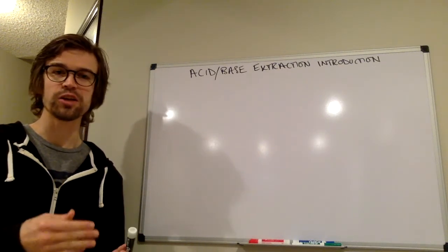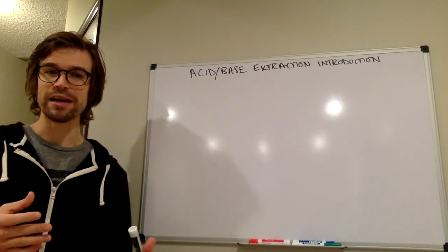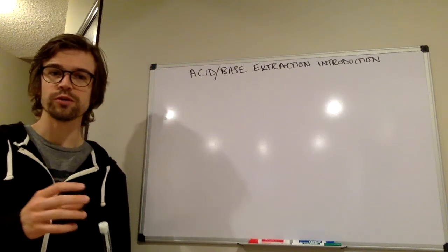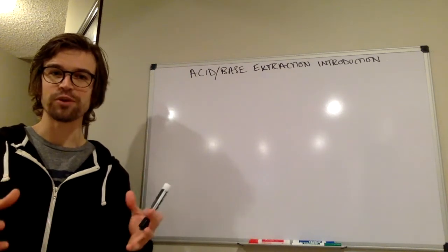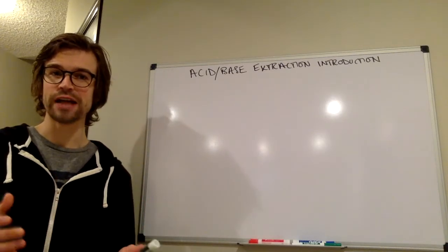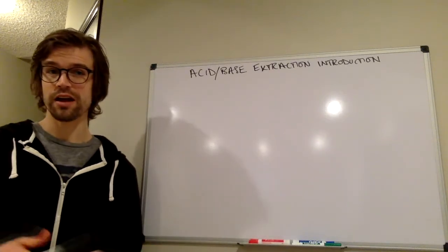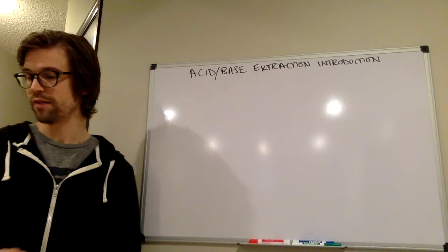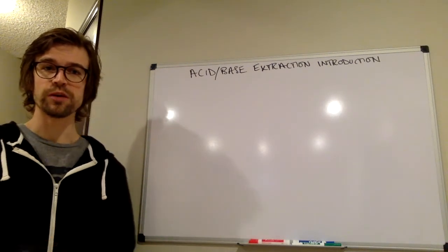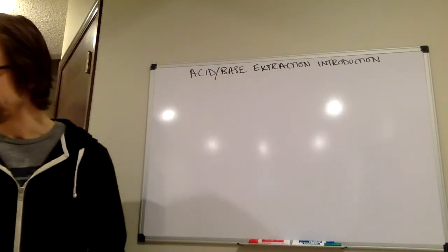So the first part of this experiment is going to be us looking at how different solids are either soluble or insoluble in different liquids. And then we will use what we learn to actually separate a three-component mixture using acid-base techniques and also extraction techniques. Something we worked a lot on in the pre-lab was what happens when we take some molecule and treat it with an acid or a base. So let's think about that for a moment.